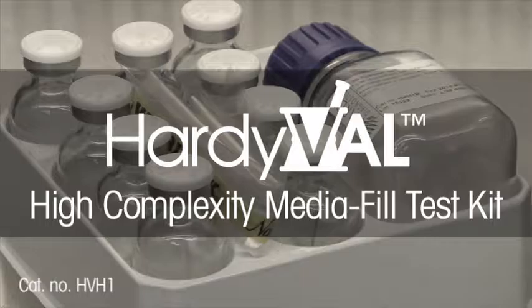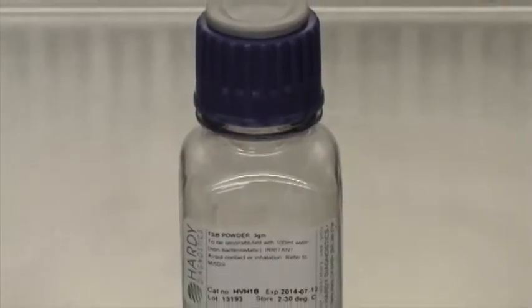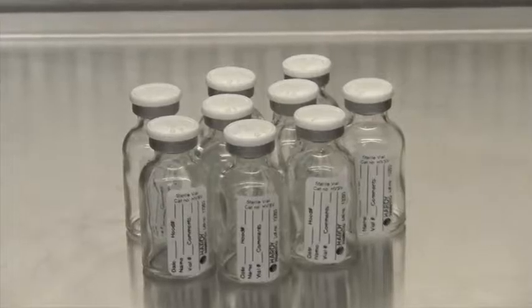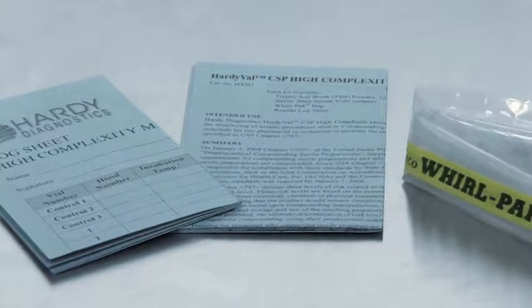HardieVal High Complexity MediaFill Test Kit contains one 125 ml bottle of tryptic soy broth powder, nine empty sterile 20 ml vials, one Whirlpack bag, a results log sheet, and instructions for use.